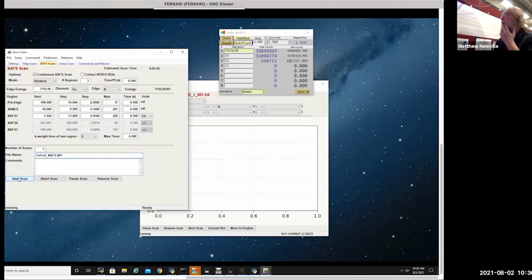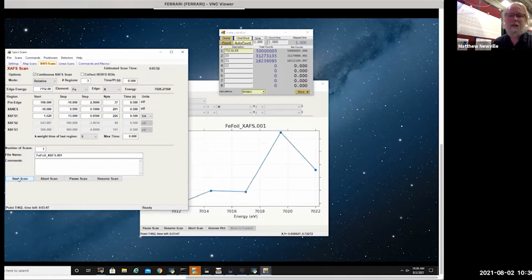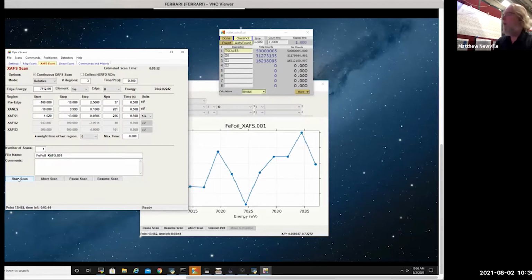When we scan energy at this beamline, we're moving the monochromator energy. The monochromator is a Bragg crystal, so we're changing the Bragg angle. We're rotating the monochromator crystal. We know the lattice constant pretty well, to six digits or so, so we know the energy that puts out. We also need, because we're taking a scan that goes 500 eV or so across the edge, to move the undulator. So at this beamline, we're moving the undulator simultaneously while we're collecting the XAFS.